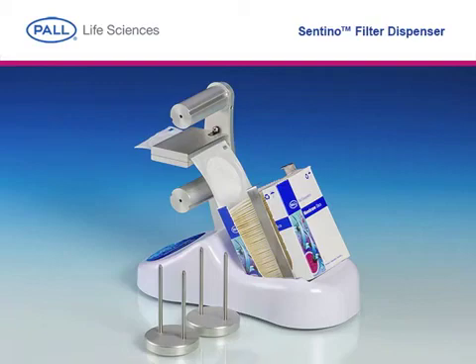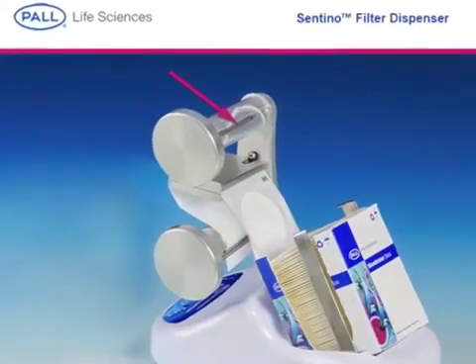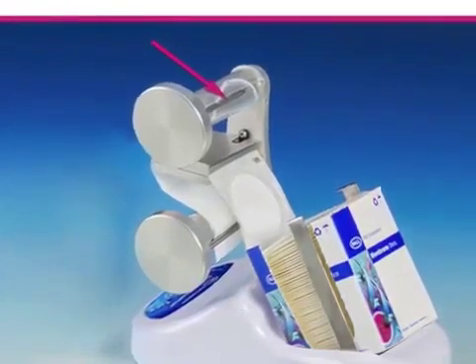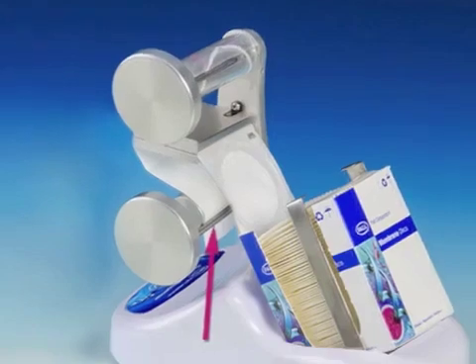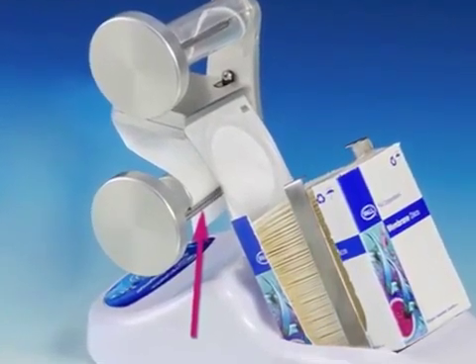Pull webbing through the guide plates and separate the film layer from the paper layer. Wrap the clear film in a counter-clockwise direction over the retention groove on the upper spool. To avoid jamming, it is only necessary to capture the film with one side of the retention clip. Repeat the process by wrapping the paper layer in a clockwise direction around the lower spool.